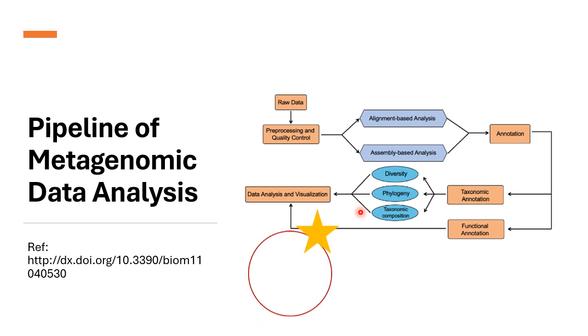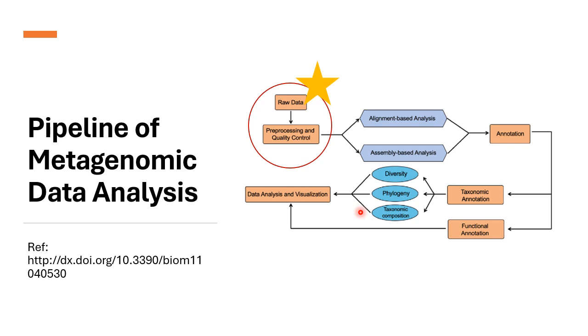So the main focus of this video will be on the raw data and the pre-processing and cleaning of the raw data, which is quality control. It's really important and essential to do because it makes the data more accurate, reliable, and ready for meaningful analysis.